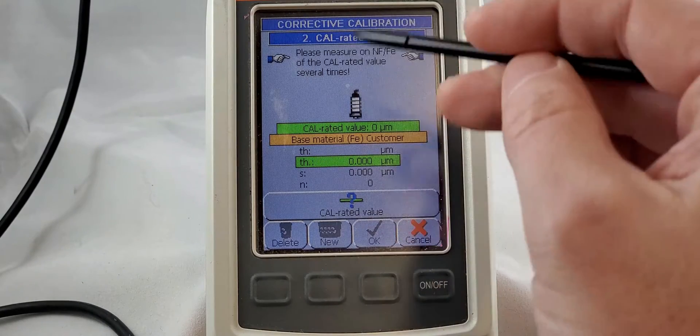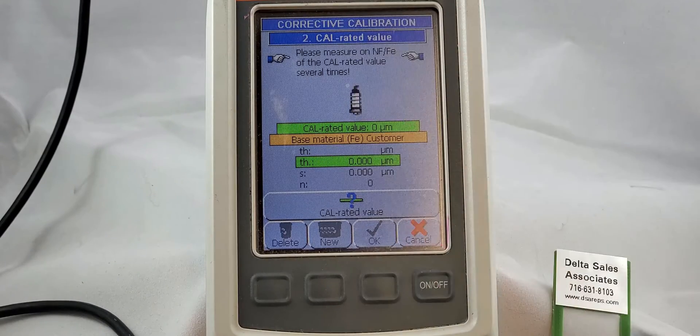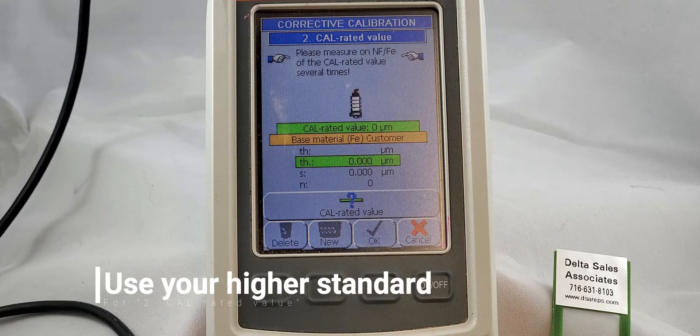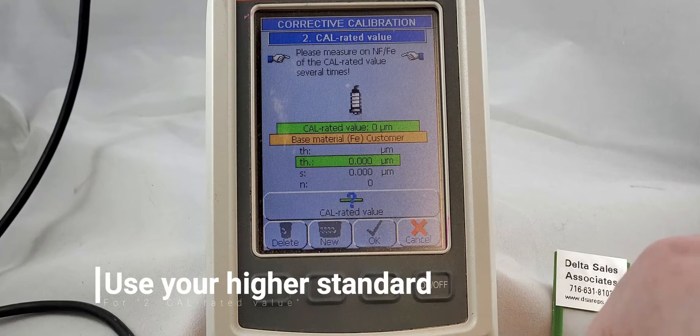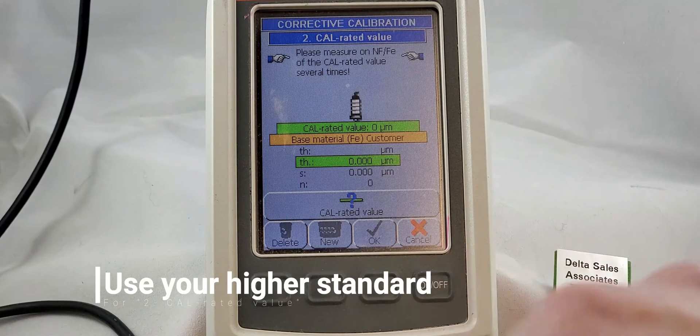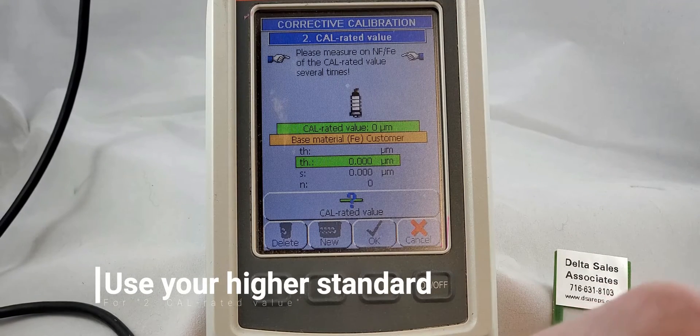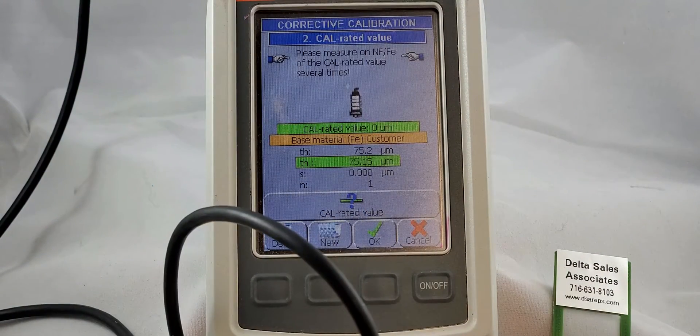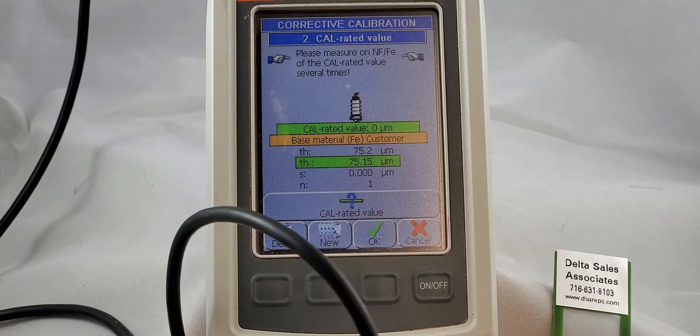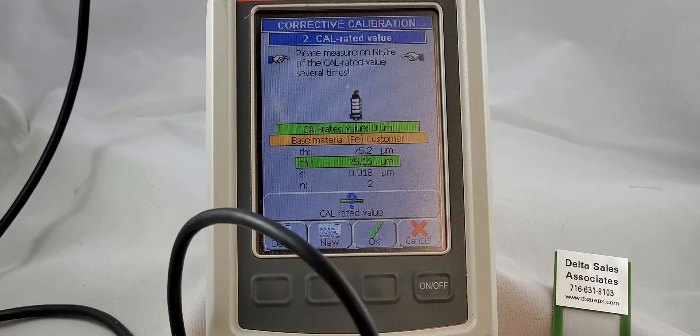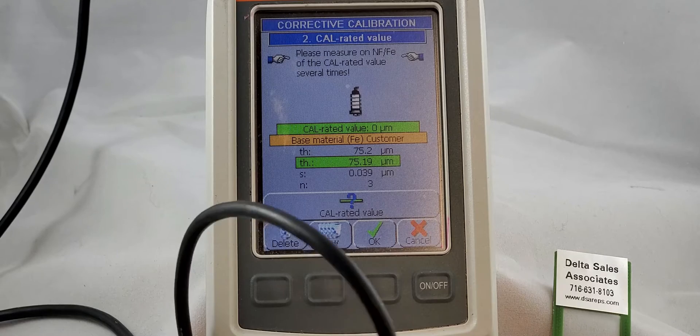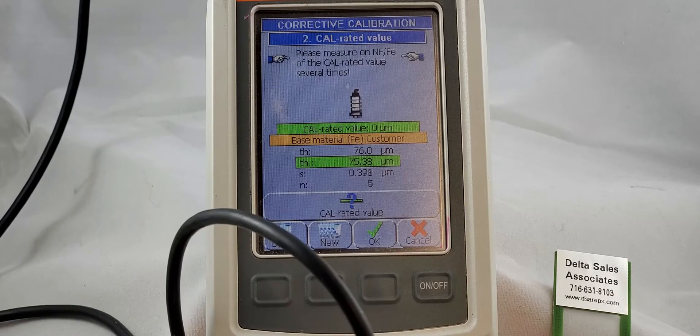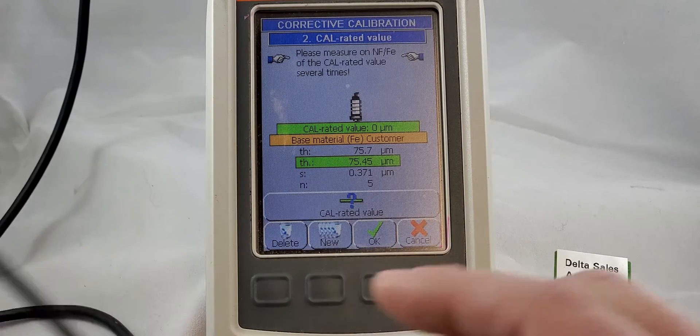And now it's going to ask for our second cal rated value. That is going to be our high standard. Again, five measurements. One, two, three, four, five.